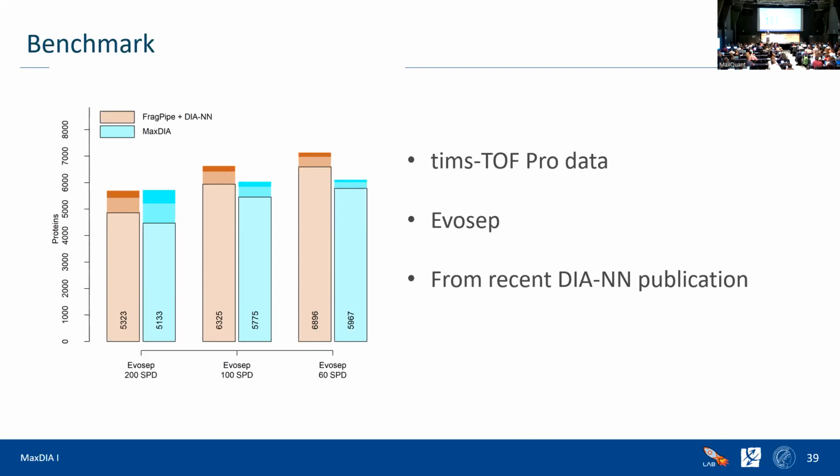You can either combine libraries and use them all together with all of the DIA samples, and you can also make sample specific libraries if you want. That you would do with multiple parameter groups in MaxQuant, and then each of the parameter groups would get its own library.